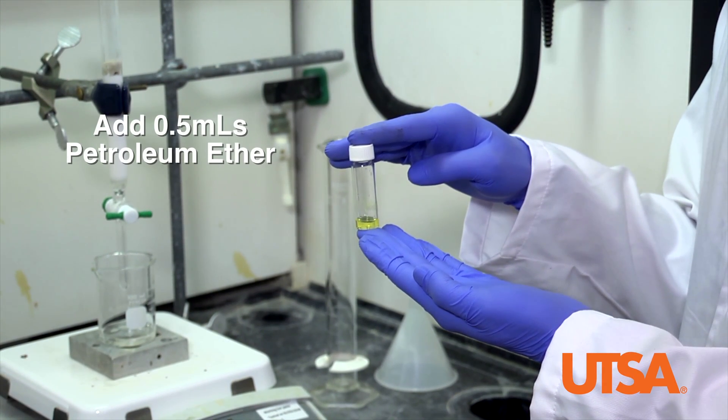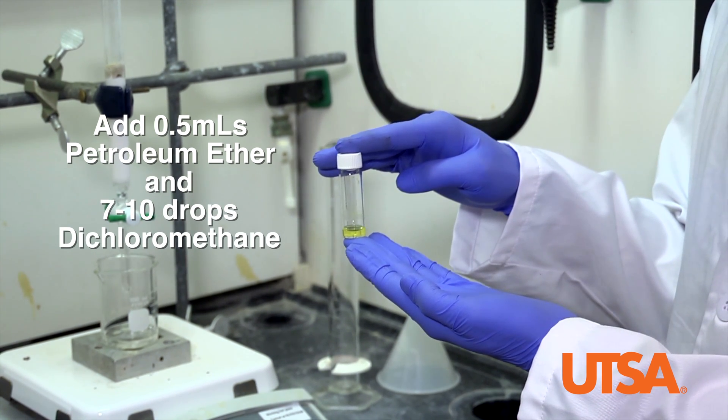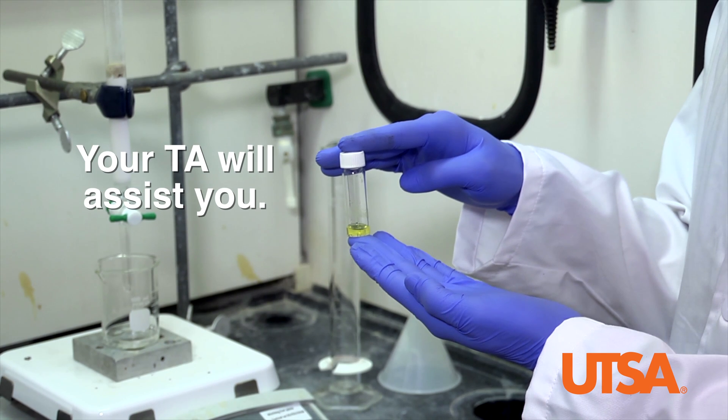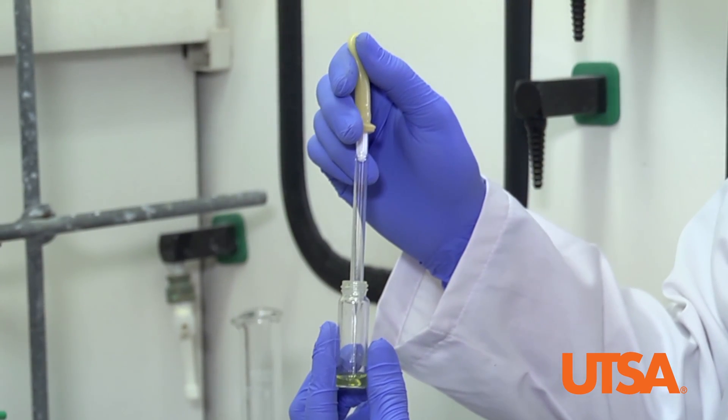Add 0.5 milliliters of petroleum ether and 7 to 10 drops of dichloromethane to dissolve your sample. Have your TA assist you with this process. Using a pasteur pipette, load your sample to the column.